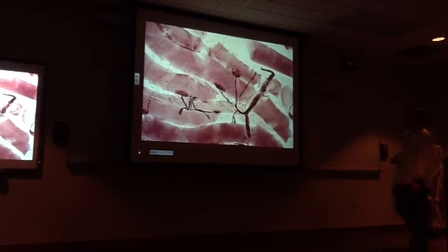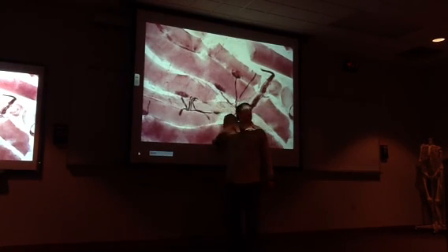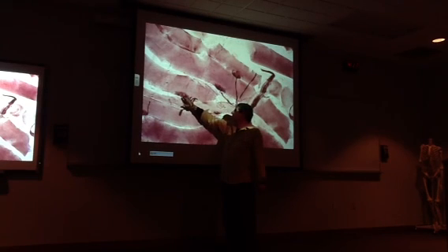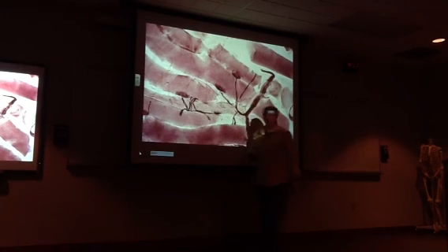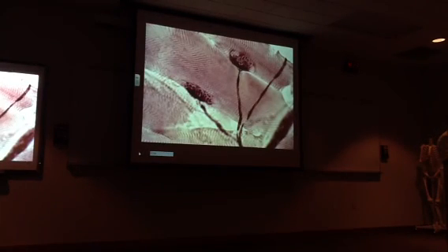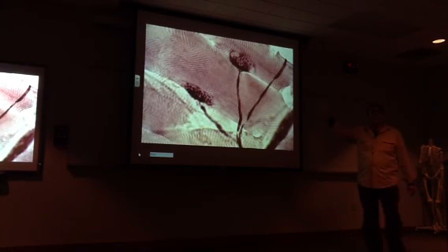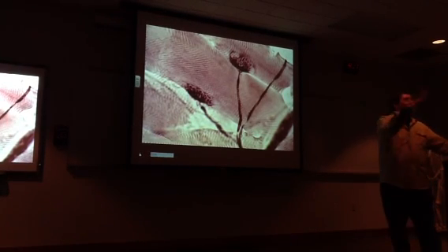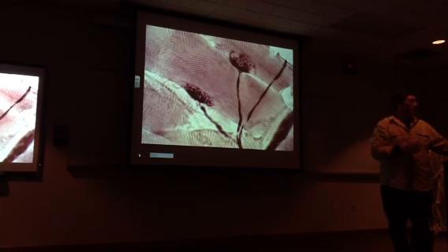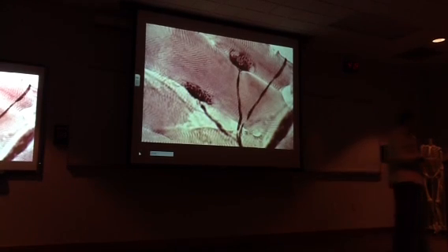This is skeletal muscle, and this is the neuromuscular junctions. And I don't know, there may be one that's one higher power with the terminal boutons on them. Okay, now in the glass slides, you're going to fret, and most of you won't see these. Maybe, you know, of 72 slide sets, maybe 10 slides are going to show these. So when you look at these in the lab, look on the QCOM atlas.